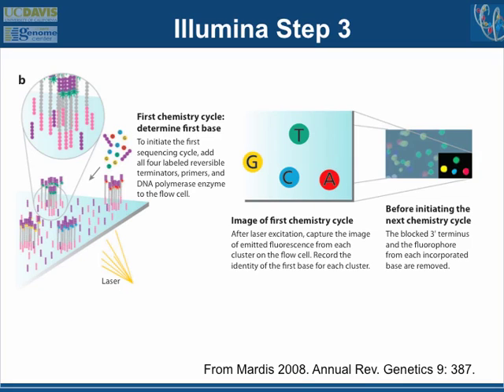And now all you have to do is figure out a way to run a DNA sequencing reaction on these clusters, and you can watch this with a microscope or with some other methodology. They tried a bunch of different methods, but the one they use is basically a nice microscope. And you run this sequencing by synthesis. The exact details don't really matter, but you get fluorescently labeled tags for each nucleotide that's being read on each of these clusters.